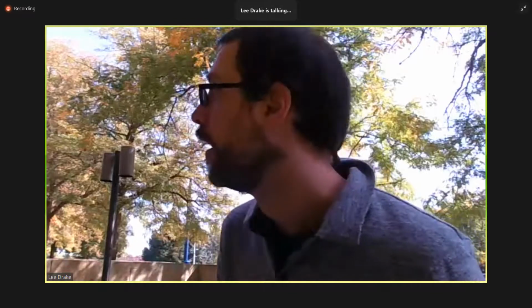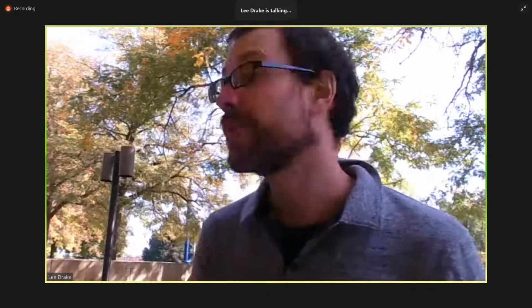And I typically only do this for about 10 seconds because you're going to have a lot of feedback from whatever you're analyzing. This technique is great because you can see a little bit of everything. It's bad because you're also going to be maximally exposed to backscatter. So you're going to have the worst detection limits for everything, but you're also going to have the most flexibility. You can think of this as a general mode.